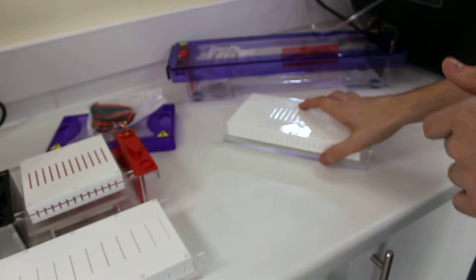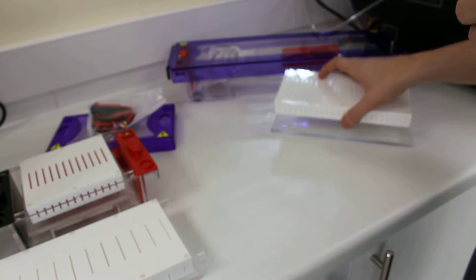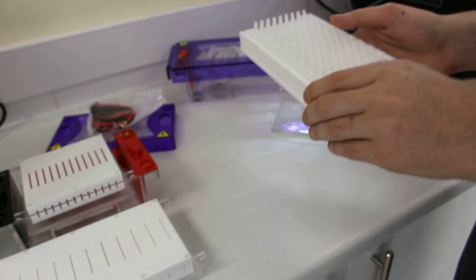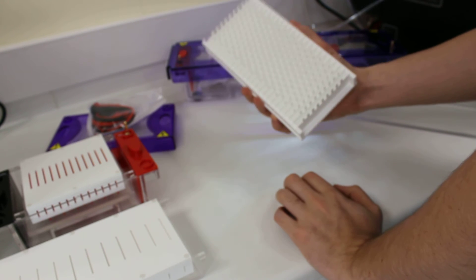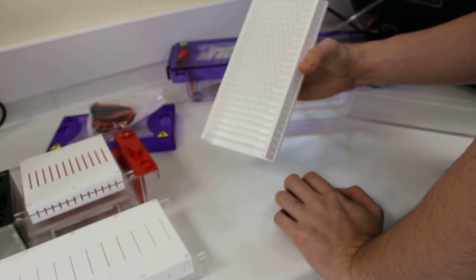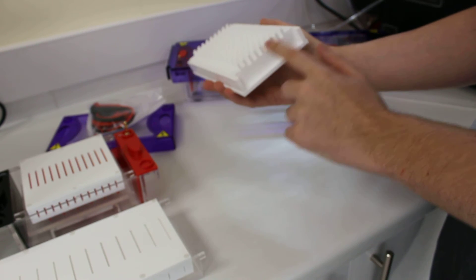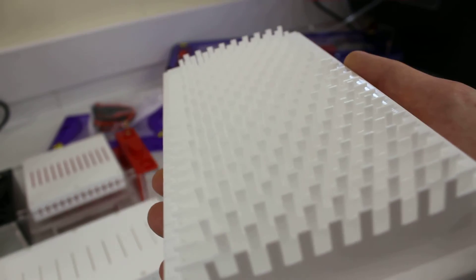The final system, which is the highest throughput system, is the MS-MIDI-96ST DBL, so double. And that is the same essentially as the MS-MIDI-96, but twice the size. So it's got enough room for two microplates worth of samples. And again, you can have one or two markers at the edge. I'll just do one last zoom in so you can see the arrangement of these.